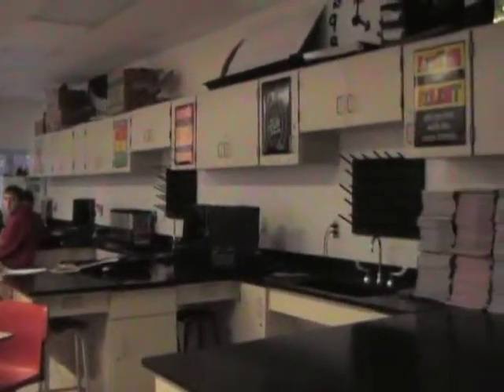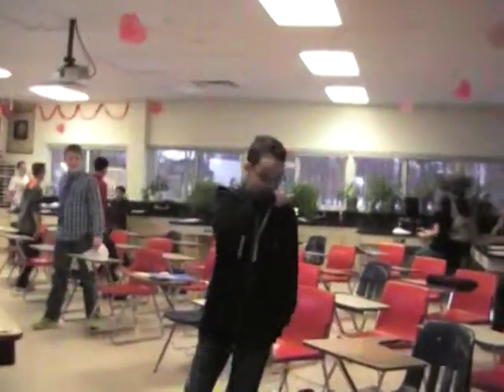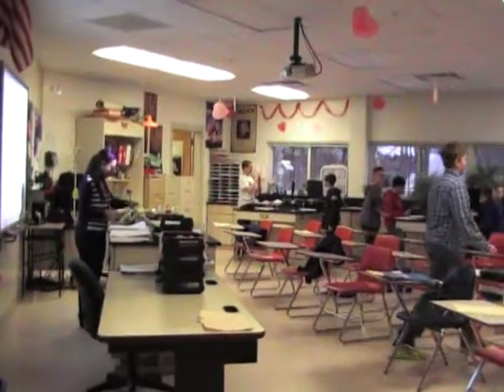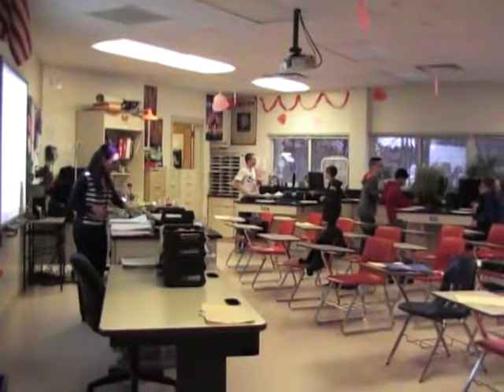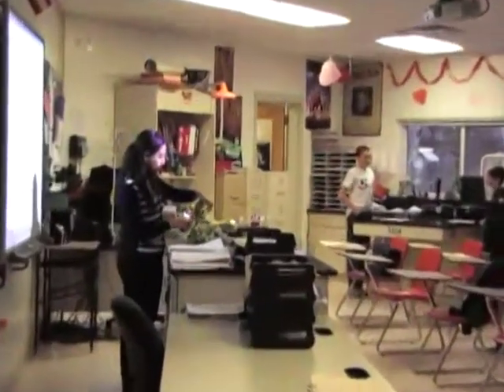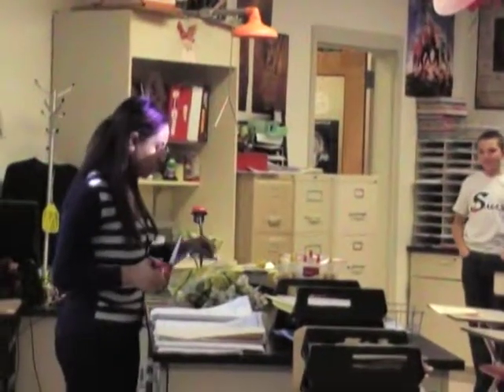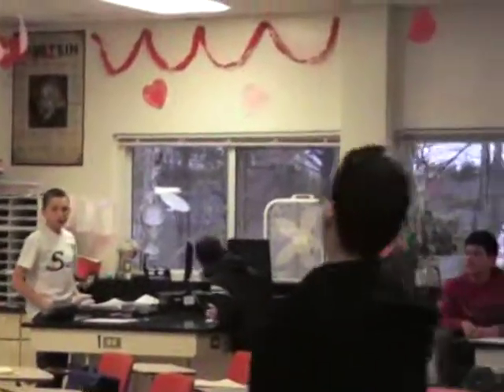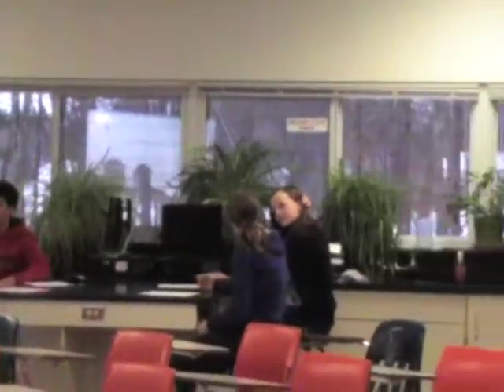Who are you working with then? Are you working together? Abraham? So you can join, there you go. All right, I'm going to call one representative from each group to come and collect the materials. So, table 6, come on up. You're going to collect a flower, a magnifying glass, and glue, and forceps.